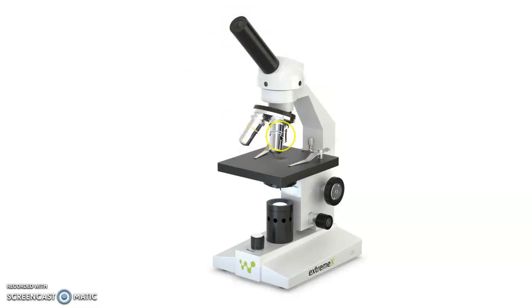If you had spun this around and you've got the 10 here, you would be looking at 10 multiplied by 10, so you'd be looking at 100 magnification.